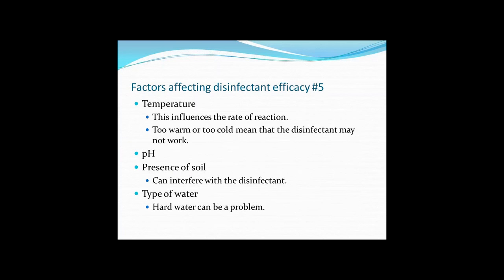Okay, furthermore to all this, we can add temperature, because temperature influences the rate of reaction. If the temperature is too warm or too cold, the disinfectant might not work, and particularly too cold, because many disinfectants that are sold, if they've been tested to the European standards, would have been tested at around 20 degrees. So disinfectants used in cold rooms may not have the same efficacy. Then there is also pH, whether any interfering factors remain behind, so that's not cleaning properly and having soiling, and also, as I've said before, the type of water can be a problem.